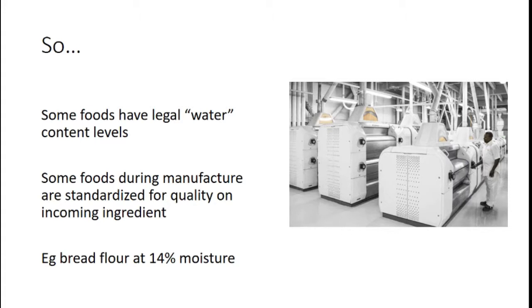It may be at 16% moisture. And this could be changing the formulation, the amount of water that you need to add to be able to make quality bread. Or conversely, maybe you're somewhere extremely dry, or that moisture content could start to impact the shelf stability of that product. So these measurements are extremely practical, and fortunately they're not too difficult to perform.